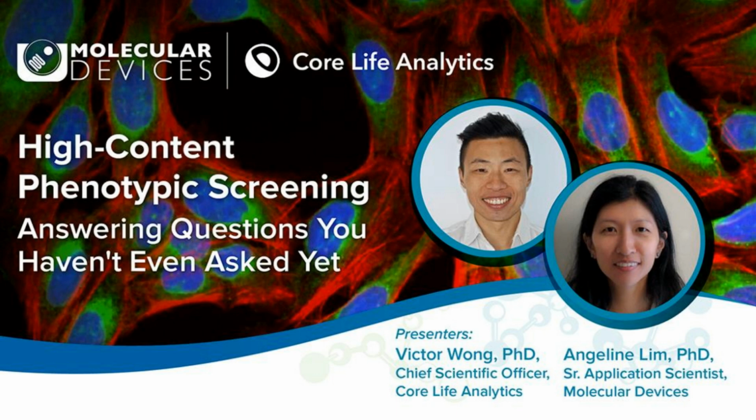This is why I strongly recommend anyone who wants to know more about high content screening to go to the Assay Guidance Manual provided by the NIH. It's a great resource and it's actually what got me started running the high content screening core over there.